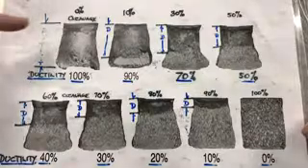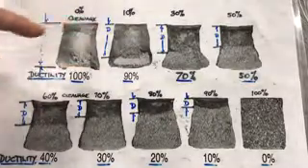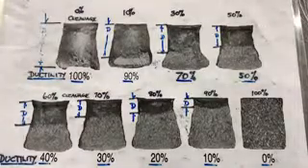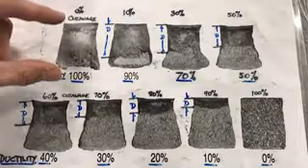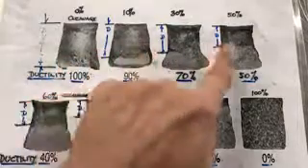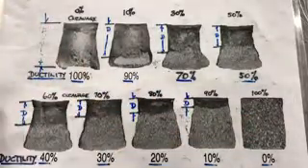So the other side of the spectrum is this example. So you see that there is a dramatic change in shape. So the fracturing of this sample was accompanied by a lot of plasticity and plastic deformation. So as you can see, the ductility here is seen like across the whole section. And now we see all different options between these two critical points.